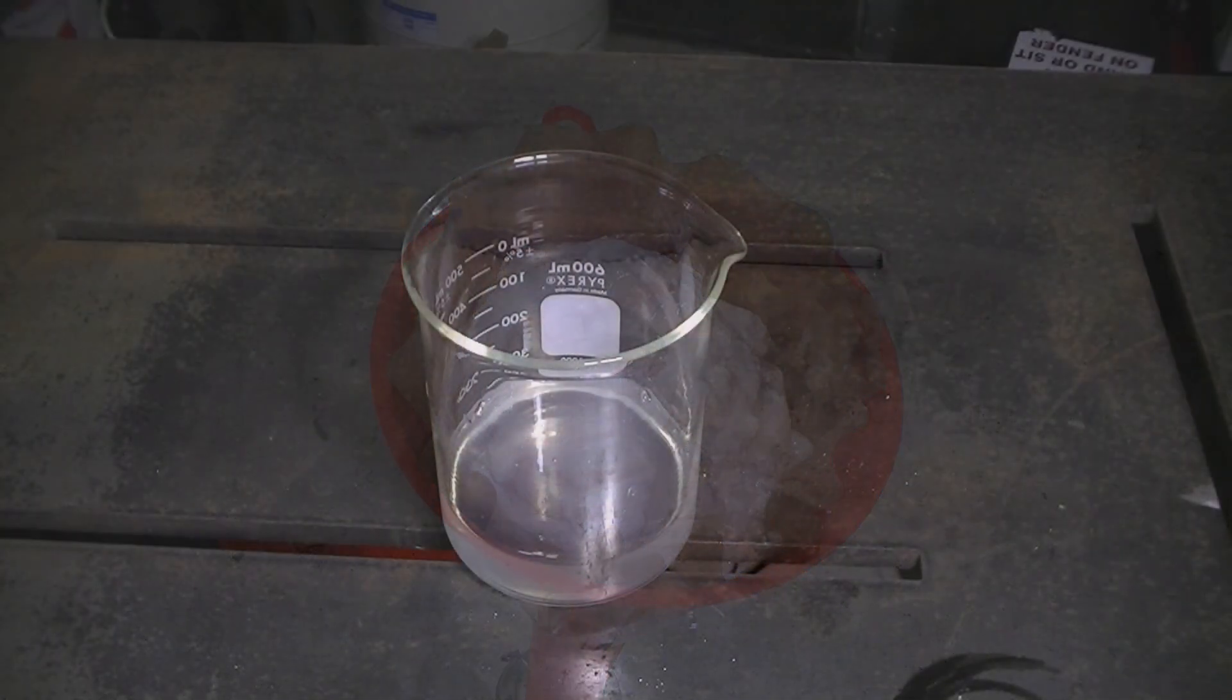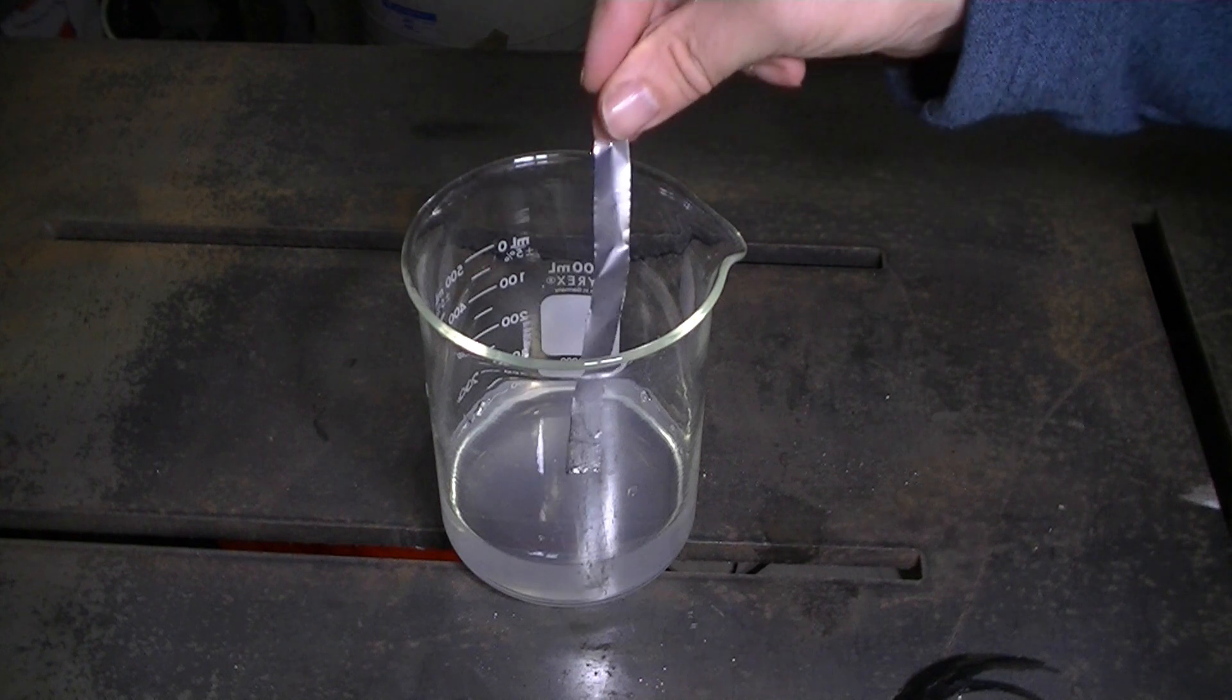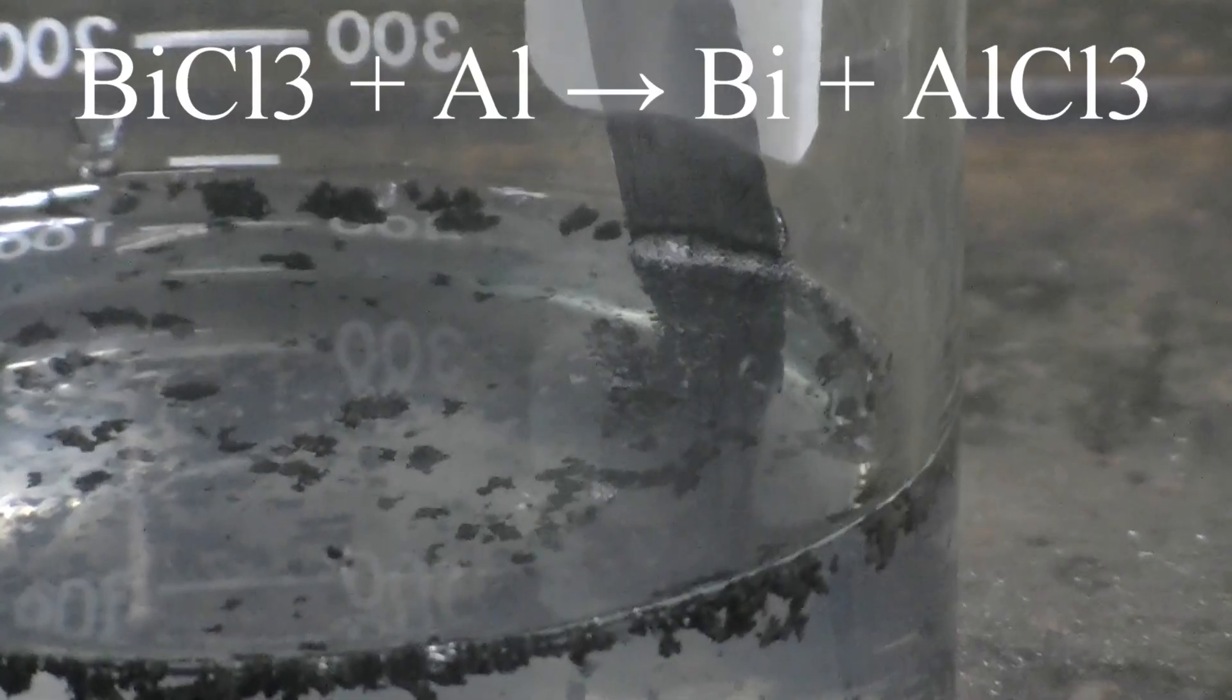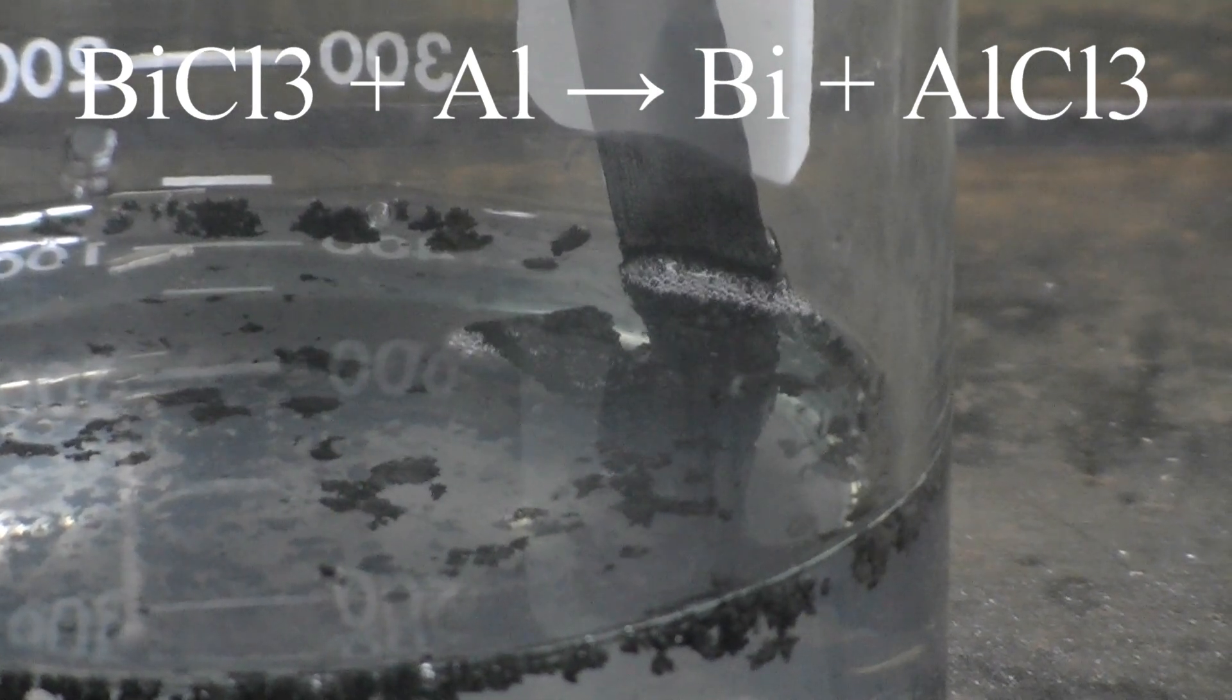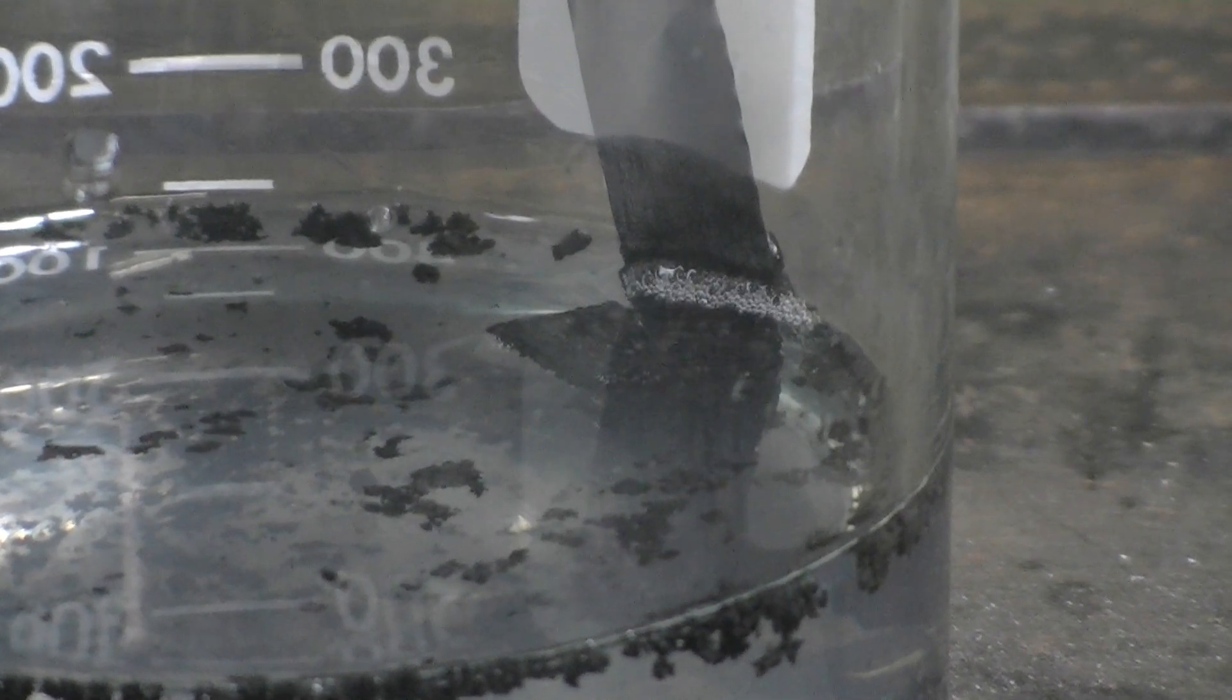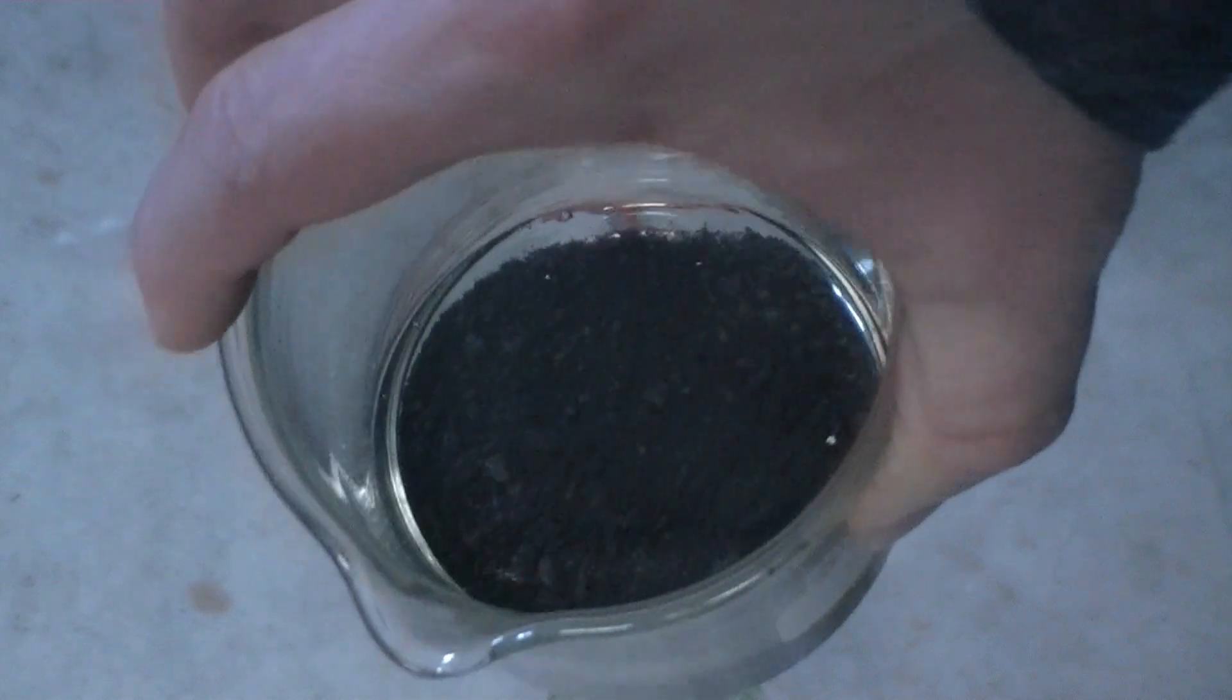So here is our filtered solution, which is clear. It should contain unreacted hydrochloric acid and also bismuth chloride. In order to get the bismuth metal out of solution, we're going to react it with aluminum. Introducing a small amount of aluminum foil results in a displacement reaction. Bismuth chloride is reacting with the aluminum to form bismuth metal, which is precipitating out of solution, and also aluminum chloride. Aluminum chloride is soluble in the liquid.